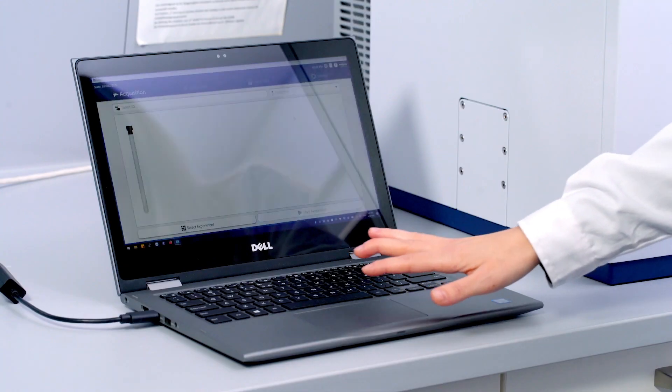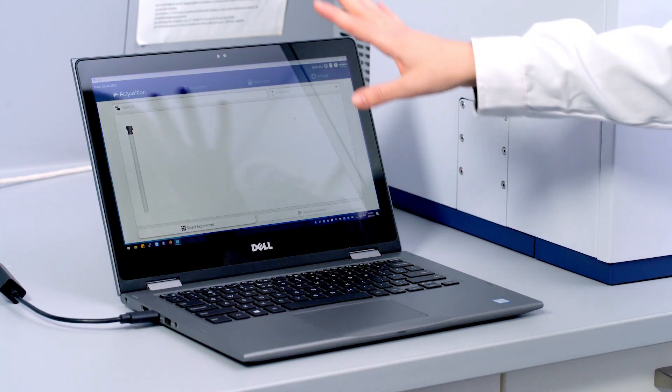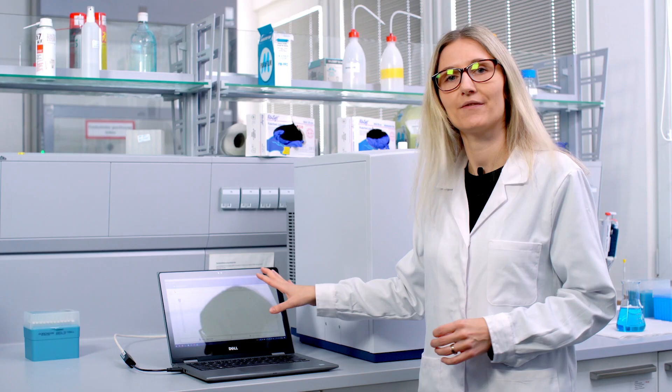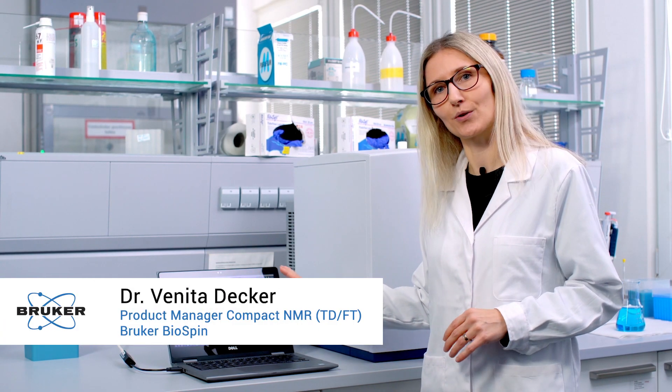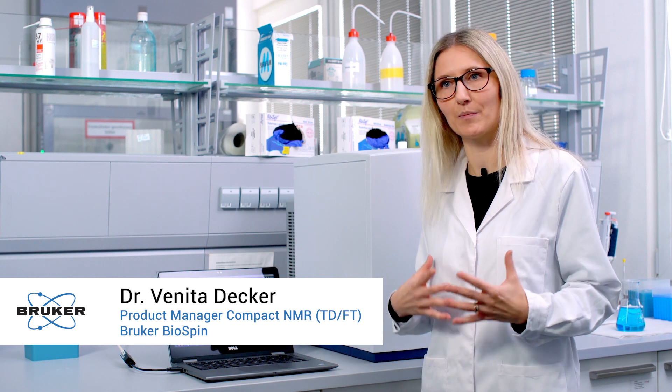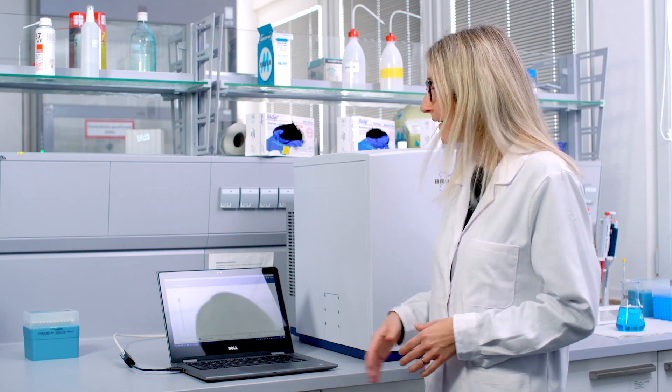With our Fourier80 there comes a nice user interface which is straightforward, called GoScan, and is really intuitive and meant for not so experienced NMR users.